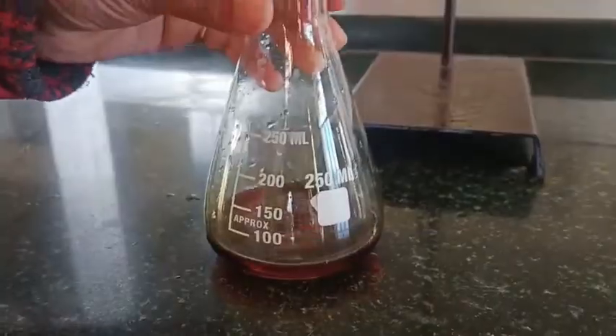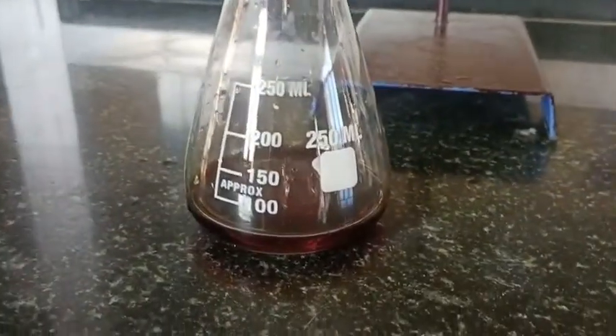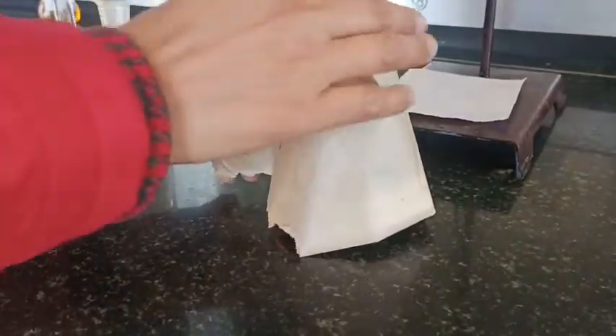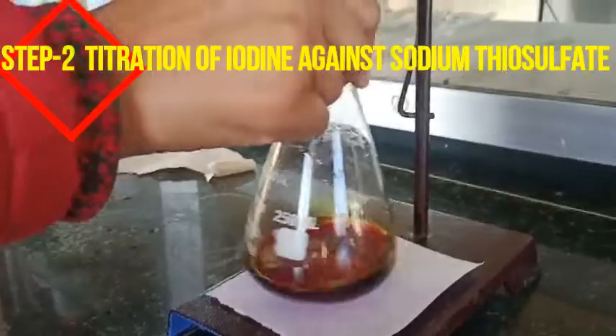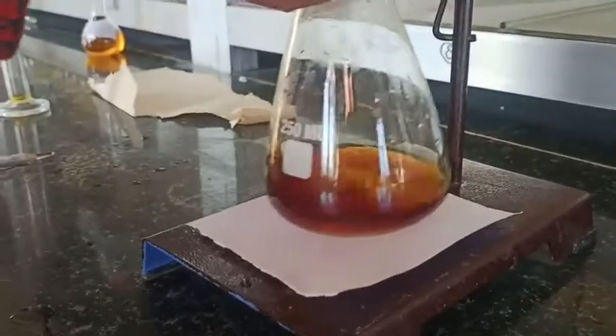Cover the conical flask with a petri dish. Before doing the titration, wrap the conical flask with brown paper just to avoid exposure to direct sunlight, because that can oxidize the iodine. Now titrate it against the sodium thiosulphate solution.